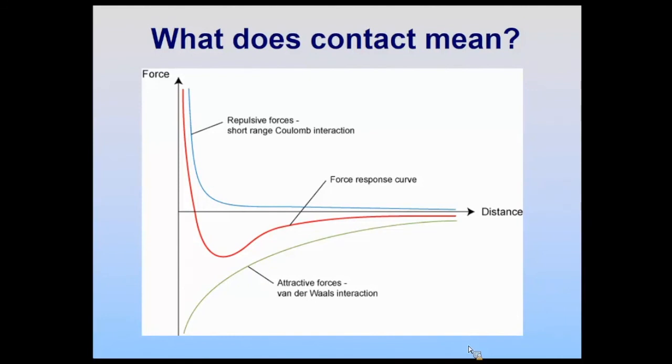So if you really try to push your tip down into the surface, the cantilever is going to bend upwards away from it. So when we say contact, what we're talking about is that place where you're in these short-range repulsive forces.